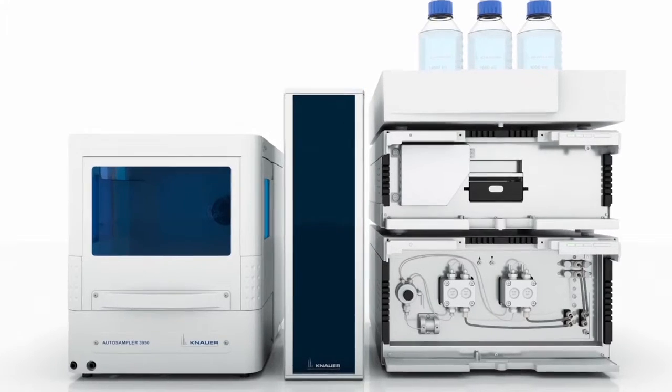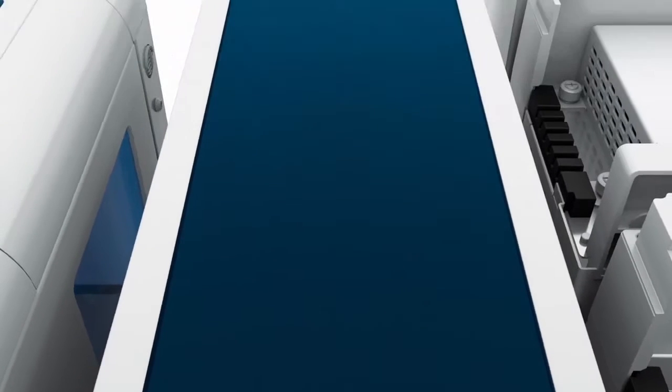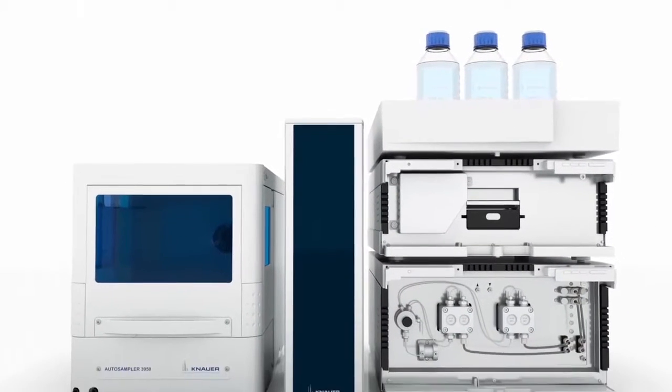To ensure a stable analysis, Knauer offers the column thermostat CT 2.1 with a temperature range from 5 to 85 degrees. It can be equipped with up to 6 columns.